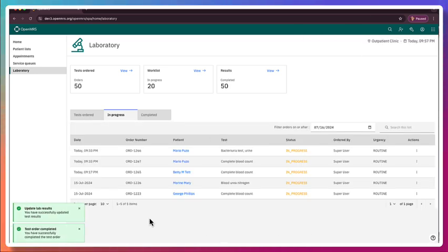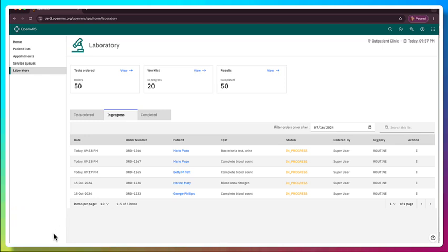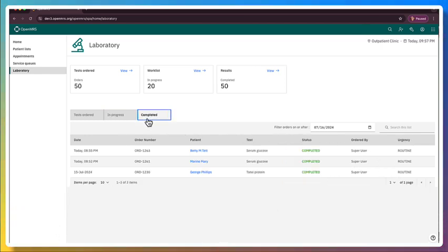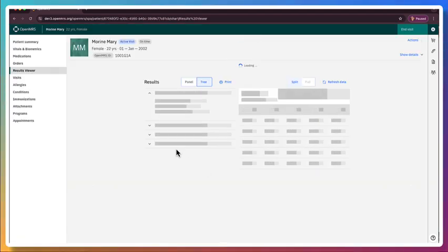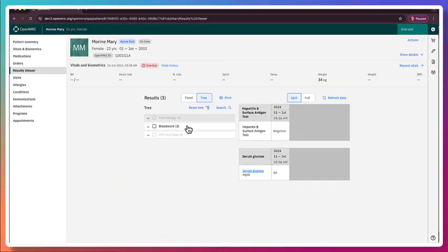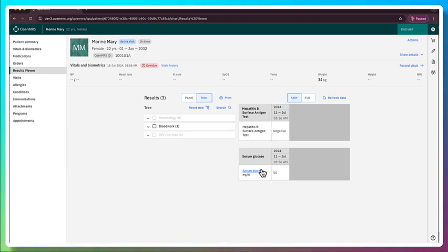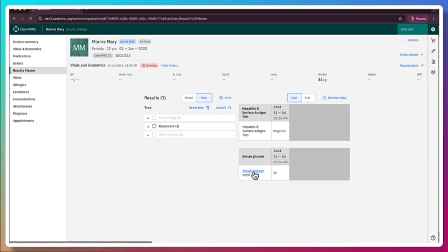All right. So the results have been updated. And now the result is here. It's been completed. So once again, if we go back into the chart, you can see here is that result from today showing the serum glucose.